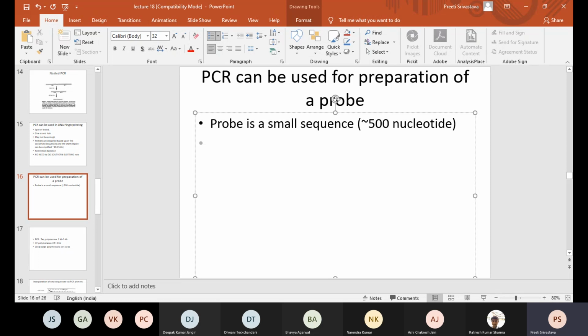But for example, when it is a gene, such as the gene for green fluorescent protein, or for a certain enzyme, for example alpha amylase, which you want to pick up. If the gene for GFP or alpha amylase is there in some plasmid, you can simply perform restriction digestion, obtain the fragment, gel elute the fragment, which I have already taught you, and then label the fragment with a radioactive isotope or fluorescent tag and use that as a probe.